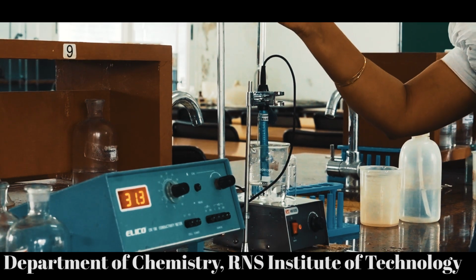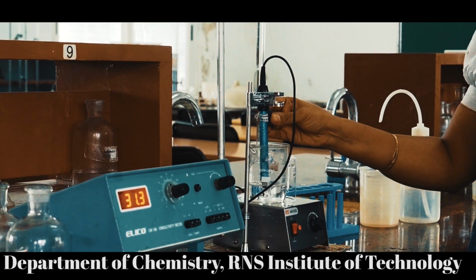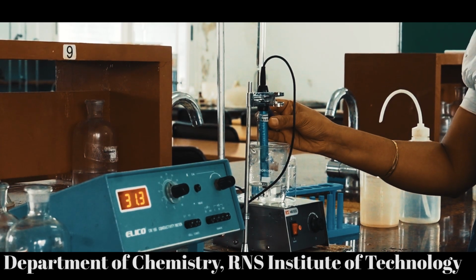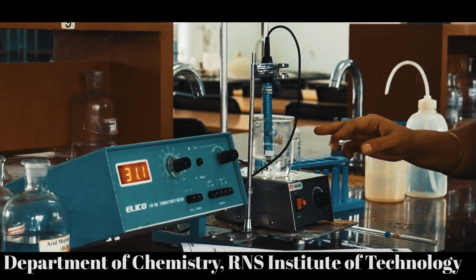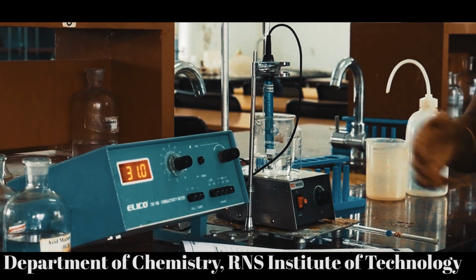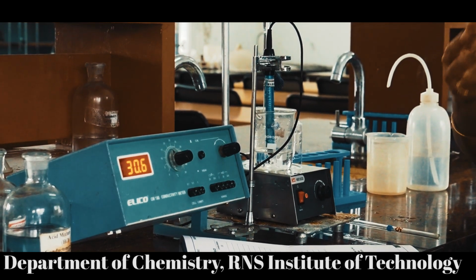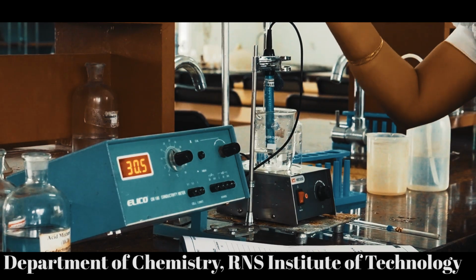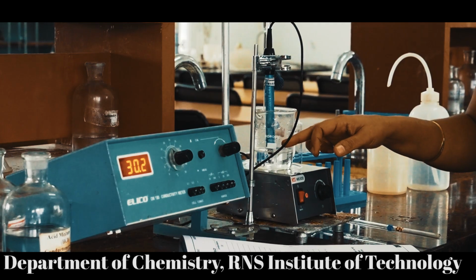So you should add the titrant in increments of 0.5 ml. Add 0.5 ml like this, then wait 2 to 3 minutes during the titration, because it takes some time for the completion of the neutralization reaction. When we add the titrant in increments of 0.5 ml, first the strong acid, that is HCl, will be neutralized.